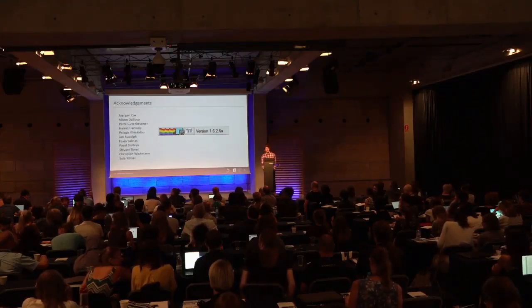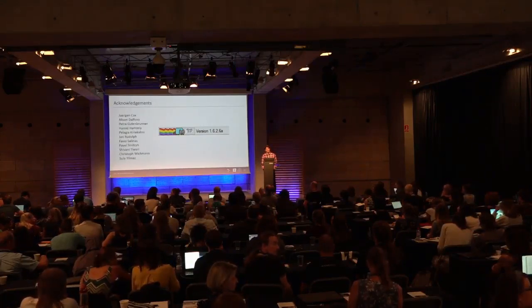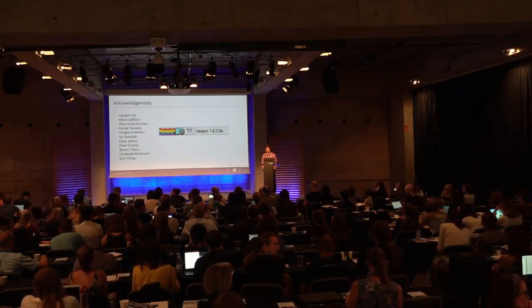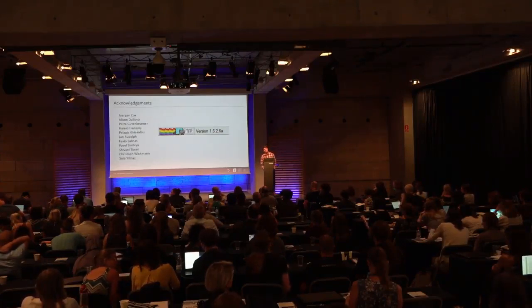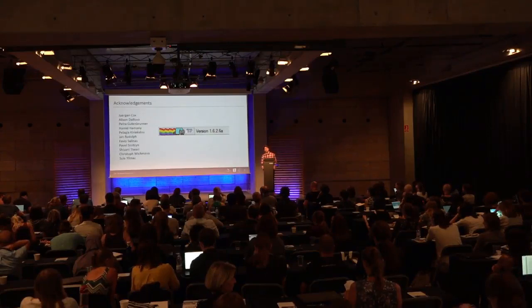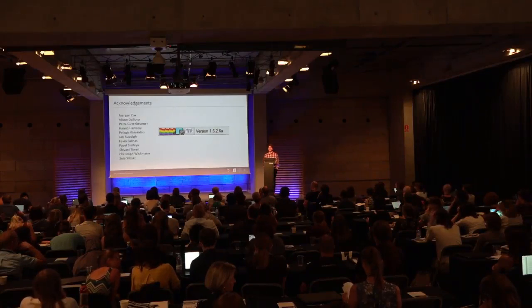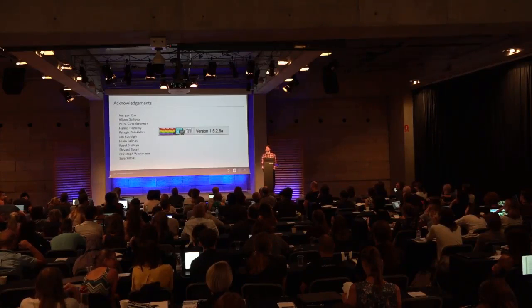Thank you for the talk. I have a question. For example, if we have a phosphopeptide-enriched sample and we're sure that we have, for example, 90% phosphopeptides in there, would it be fair to give a higher score to the phosphopeptides as compared to the non-phosphorylated peptides, and are there ways to do that simply, or you wouldn't do this at all? So you're trying to say limit the search space only to phosphopeptides? Yes, or initially give them a higher score than the non-phosphorylated peptides.